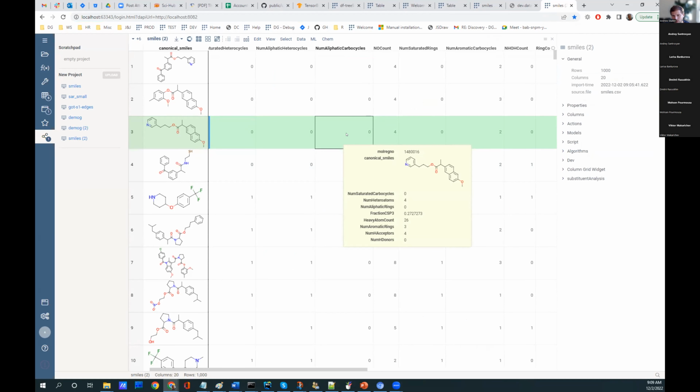Okay, I'm moving on meanwhile to the next feature that we are demoing today. It's somewhat similar to the frozen columns, but you probably guessed it, it's frozen rows. So in the very same manner as we can freeze columns, we can select our objects or molecules of interest.